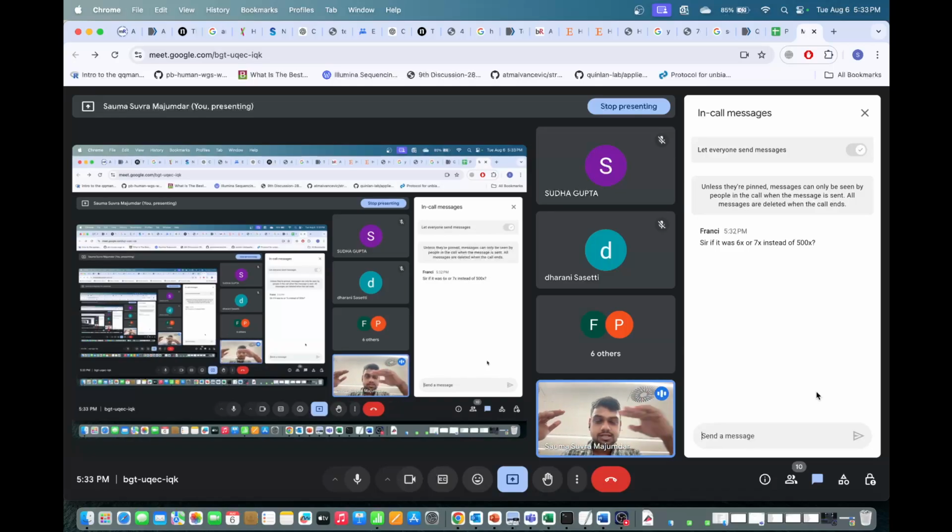Now across a thousand, the reads will be overlapping across all the thousand base pairs. Now in that particular small 100 base pair region, the number of reads will not be there. So what will happen is, in the whole thousand base pair region, your total number will go down, because you have not generated reads from certain portions of that region. So your total number will go down, so your sequencing depth will be going down.